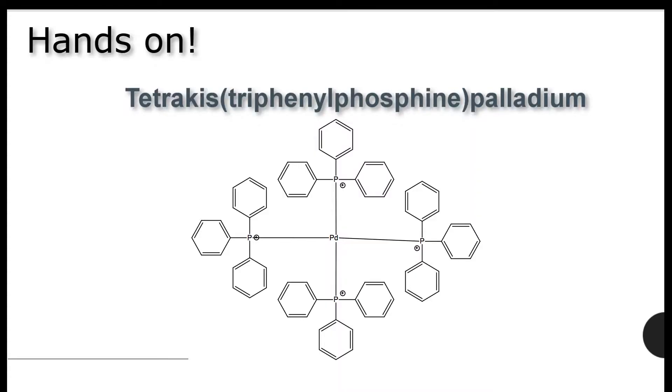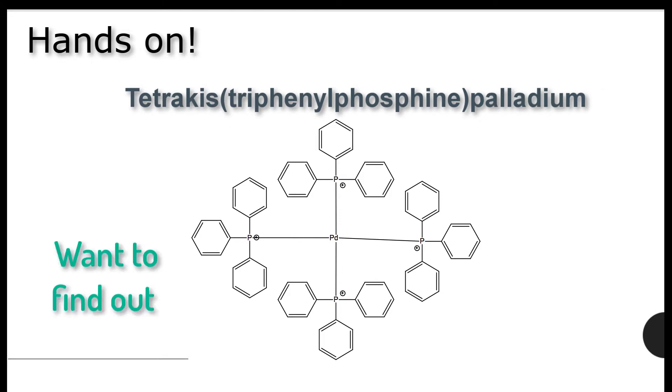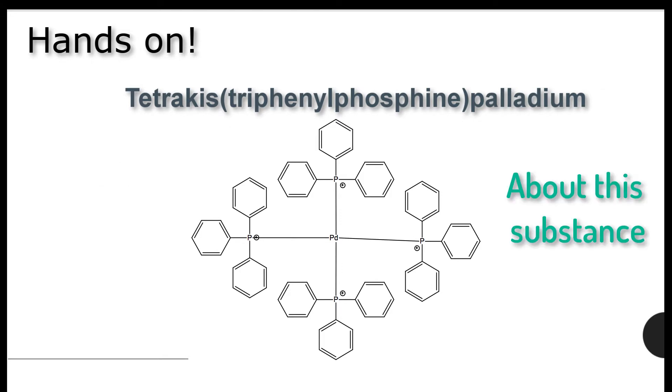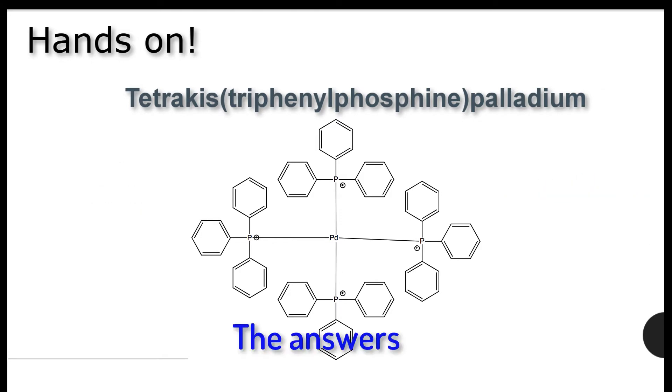Today, I will be using tetrakis triphenylphosphine palladium to illustrate some key features of Reaxys. For example, if we want to find out more about this substance, Reaxys can provide the answers quickly. This is how we go about doing it.